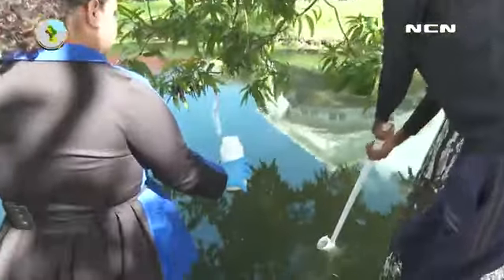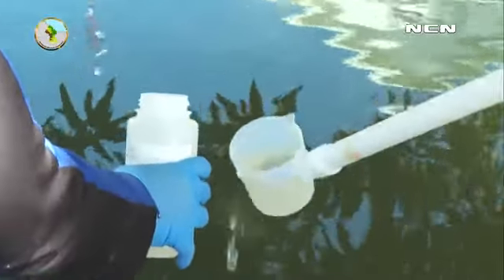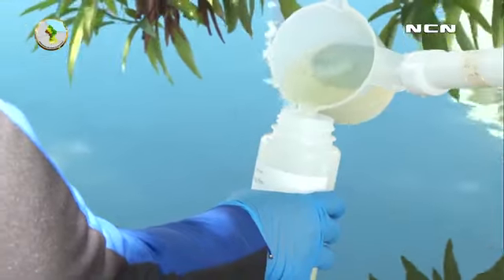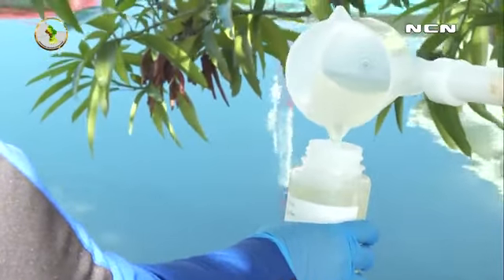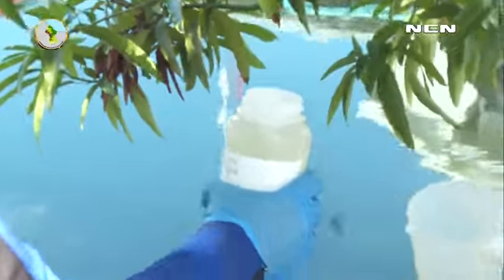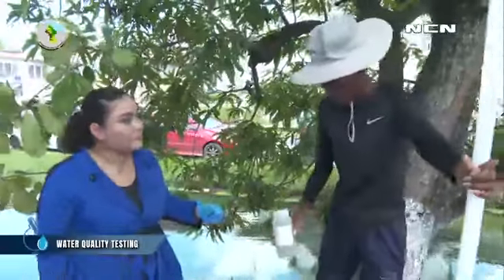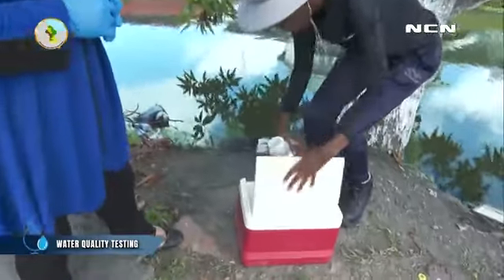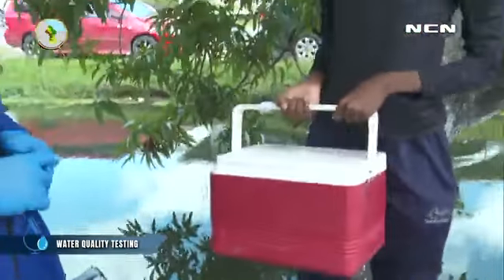I am currently taking a dip of water with the sample grabber. And this sample will be going back to the water quality lab at the Hydromet service, where we will perform certain field parameters to determine the suitability of this water for farm animals. Now the water sample will go into the transportation kit, where it will be taken to the lab for further analysis.